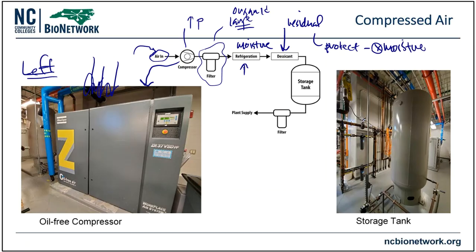So from point A to point B, that transfer line might actually incorporate a little bit more moisture into this compressed air, and we don't want that. So desiccants help take care of that. It prevents the reabsorption of the moisture that might take place.